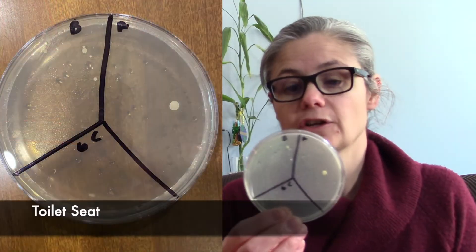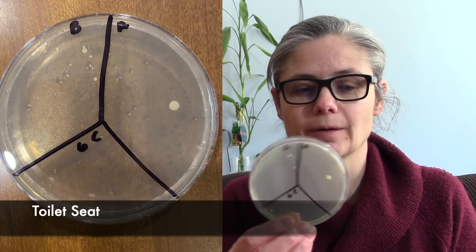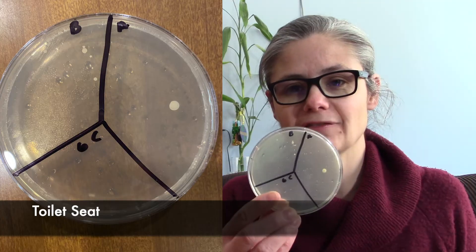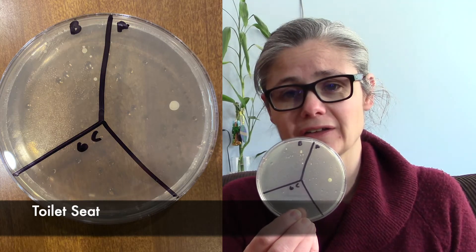And the toilet seat. So here, I didn't get a lot of bacteria in my before. So when I have a dish that looks like this, where you just have a few tiny colonies in the before section, I usually just nix it out of my results because it doesn't really show a great before and after, like what it can do. It just means that my toilet seat was cleaner than, let's say, the toilet base.